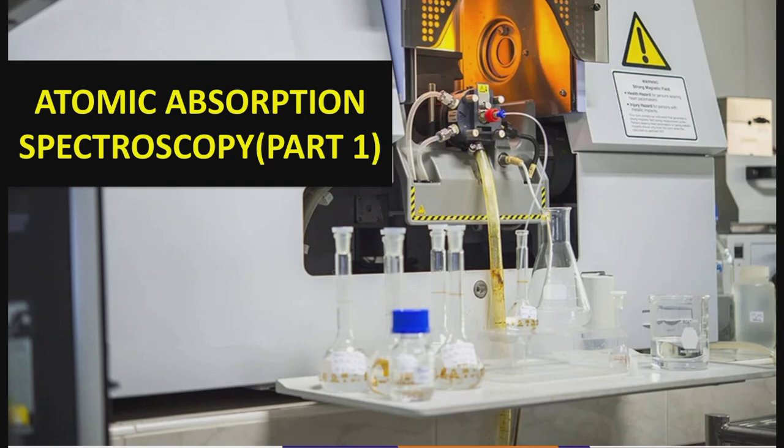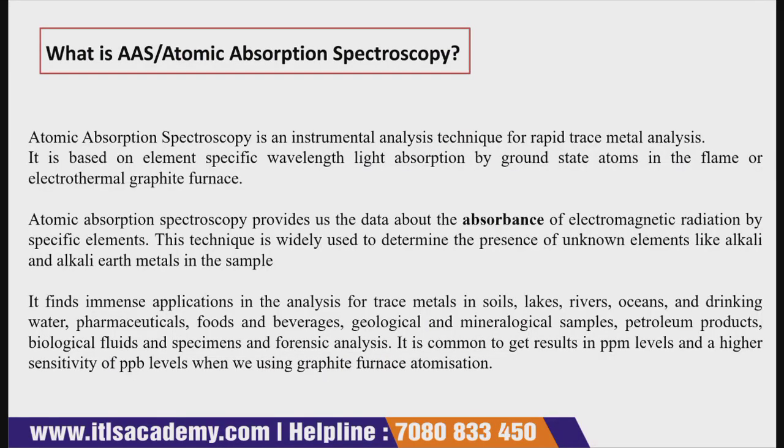So today in this lecture we are going to study atomic absorption spectroscopy. In this lecture we will cover the principle and the instrumentation of atomic absorption spectroscopy. We will discuss all the components of the instrument in detail, and we will also see some important questions related to atomic absorption spectroscopy.